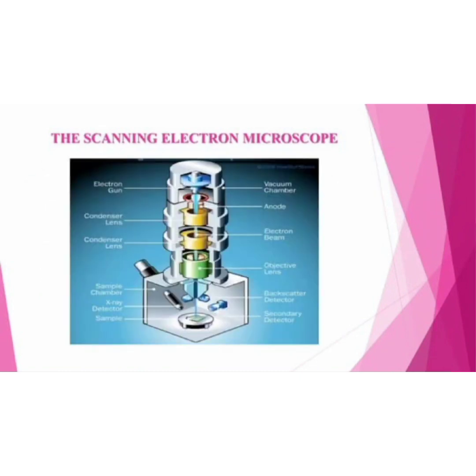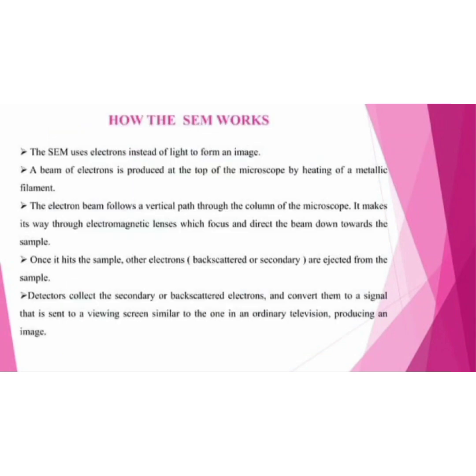This is a scanning electron microscopic image. How does the scanning electron microscope work? The SEM uses electrons instead of light to form an image.